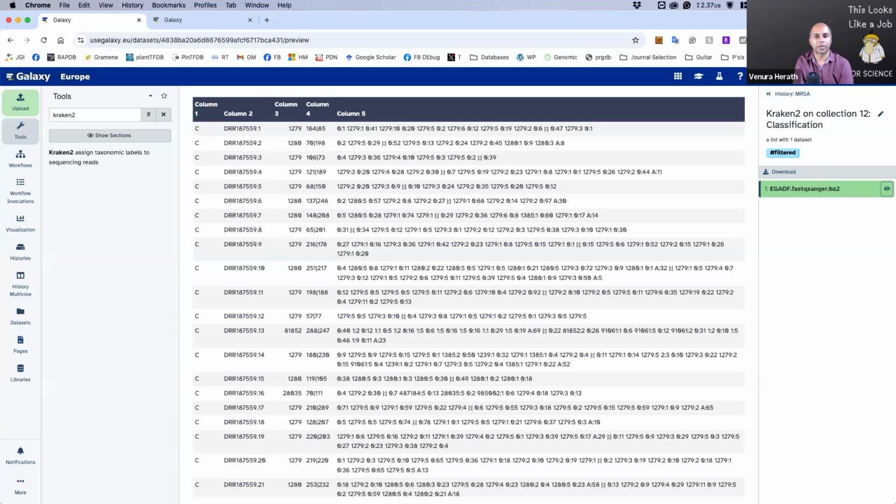When you think about accuracy, we can go up to strain level accuracy, which is very precise, as long as we have the sequences of the strains inside our database, because we are not trying to find new species, but rather to match species with the pre-built database.